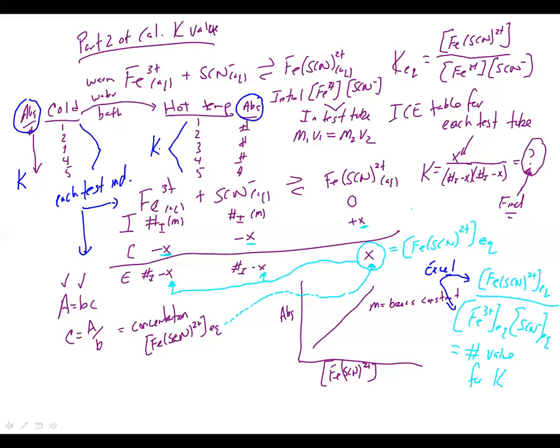So you could technically do each one by hand, like I just did on the board there with the actual numbers, or you can put it into Excel. Usually you'll have a column of your initial iron concentrations for each of those test tubes. You'll need the initial concentrations of the thiocyanate for each of them. You'll need to put Beer's constant into a column or a cell.